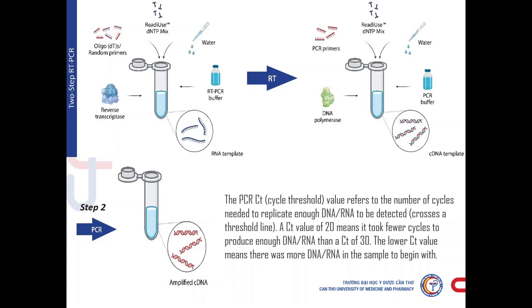load in a patient specimen, which means less amplification is needed to detect a positive, and a high CT value is generally considered to indicate a lower viral load in a patient specimen, that is, more amplification is needed to detect a positive. Currently, there is no consensus as to whether or not particular CT values correlate with a person being infectious or not, or risk level for disease severity. So, appropriate care should be taken with interpretation of CT values.